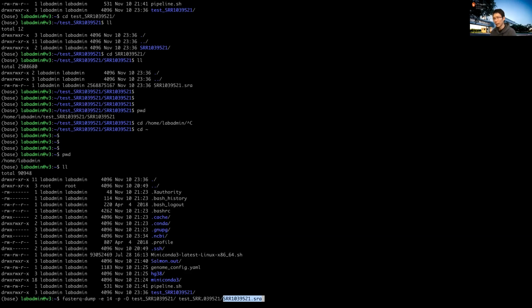That's why I wanted to change back to our home directory first. Let's try this. If you don't type the folder name right here, and you look at our current directory, there's no such file called this.